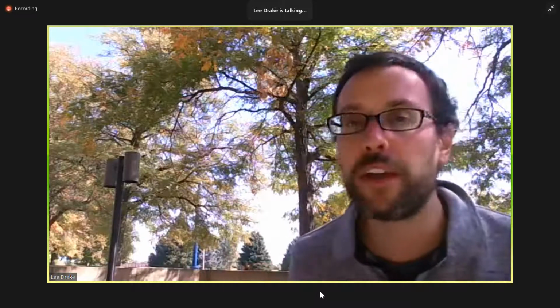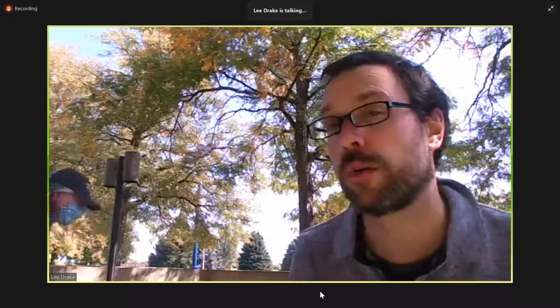So in any case, with lead, the problem you're going to run into is the lead M line is going to almost perfectly overlap with the sulfur K line. This is one of the big challenges in measuring historical pigments, because if I'm looking at the Mona Lisa, they use lead-based pigments, but sulfur is very important for a conservator to know about because it's so reactive.